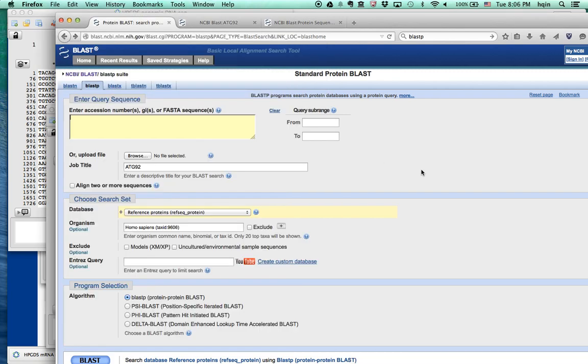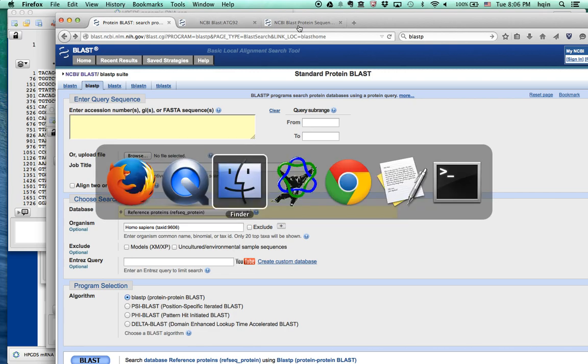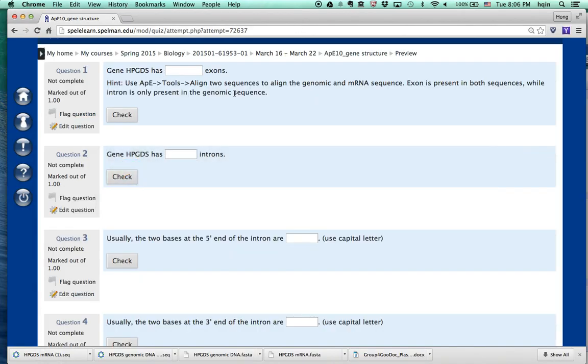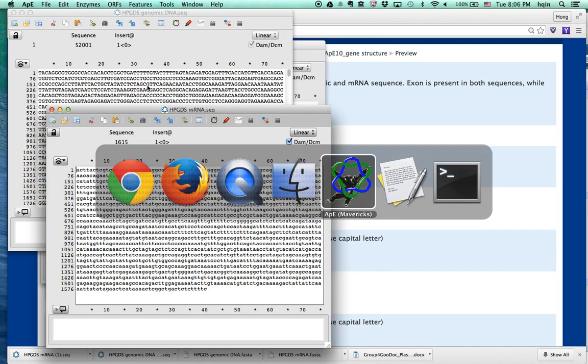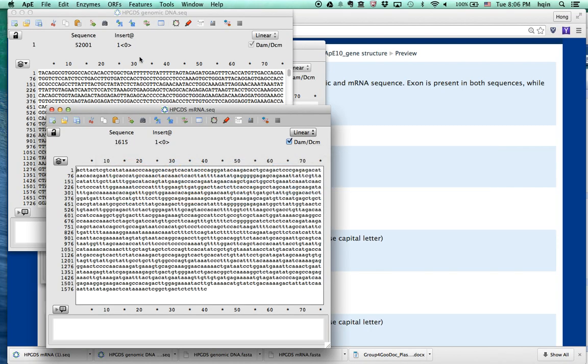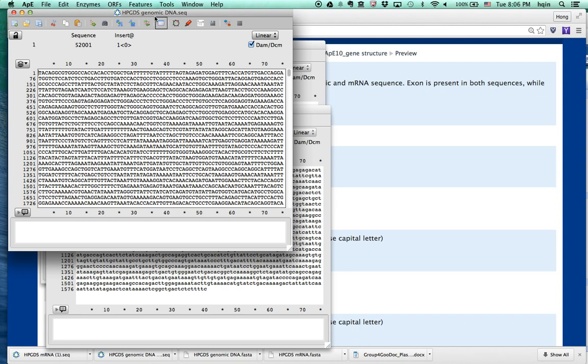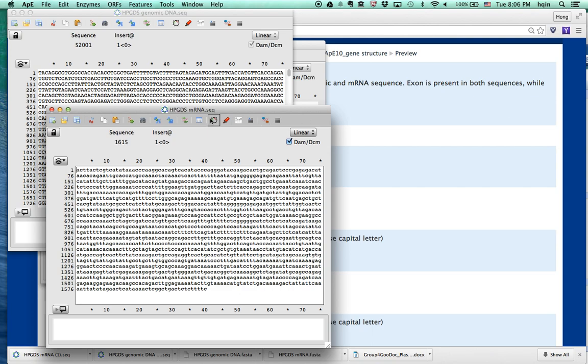So the question is, we give you a gene called HPGDS. The question asks you how many exons are in this genomic DNA. So we can use APE to open up the genomic DNA sequences, HPGDS genomic DNA, and we can also open up mRNA sequences and then we just align the two sequences.